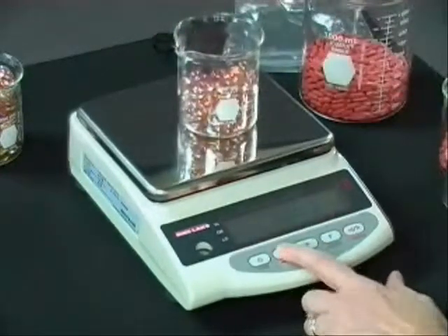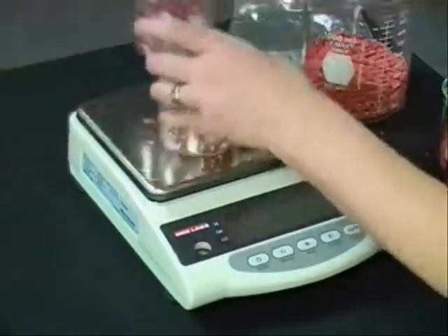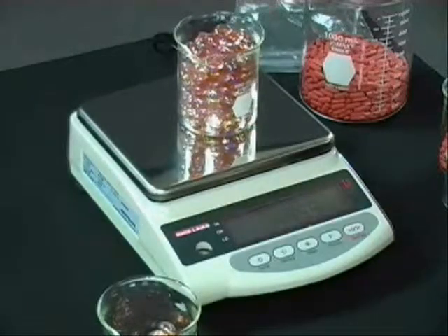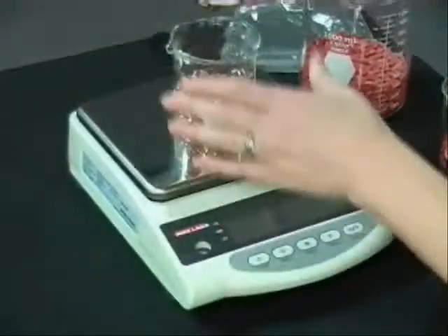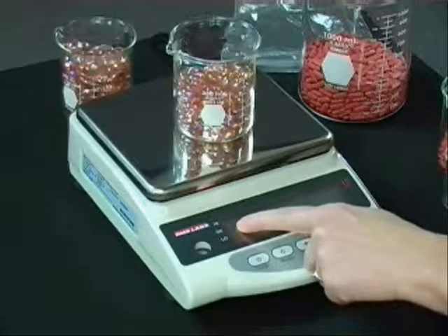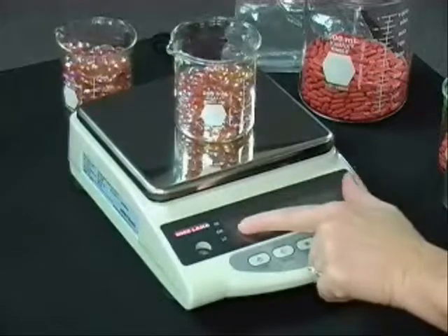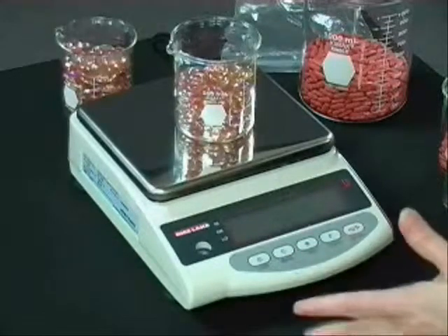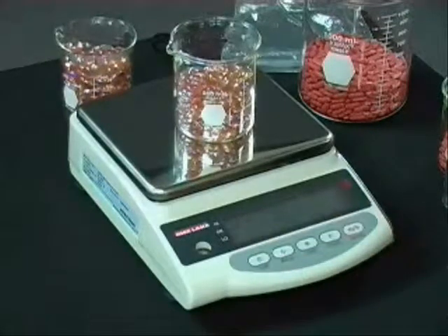I'll put my target value on here and press set. Now it's telling me to set my high value — put my high value on and push set. So now, as you can see, anything in between these two values, the okay light is going to come on. The little arrow by the okay indicates my weight is within the values I've set up. This helps operators utilize the balance quicker because they don't have to read the display — they just know it's okay and can go ahead. When the low light comes on, they need to keep adding. Studies have proven that if operators are just looking at a visual indicator rather than concentrating on the actual display, they can actually operate faster.